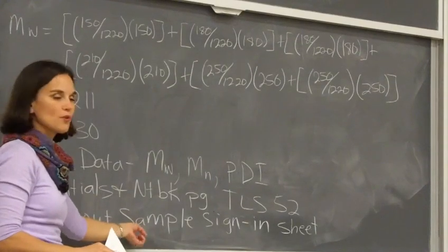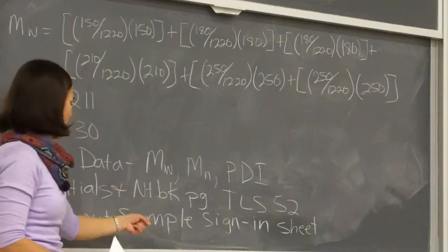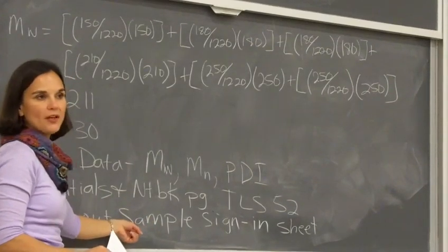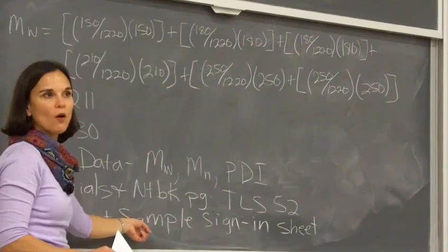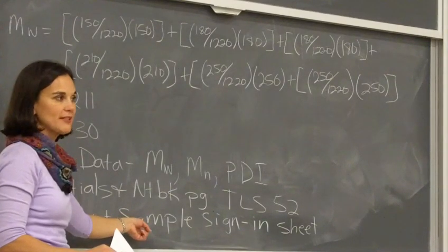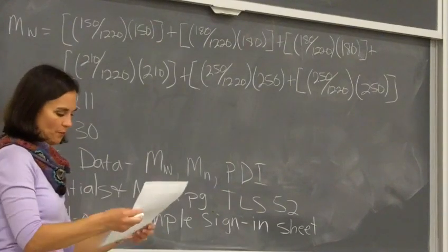Make sure that both of these you can read, especially this one, because this is what's going to go into the computer, and this is what you're going to use to figure out which GPC data is yours, okay? So make sure this is really legible, okay?